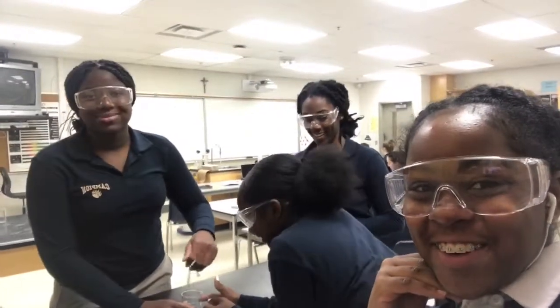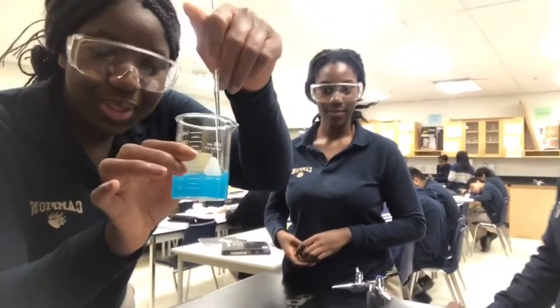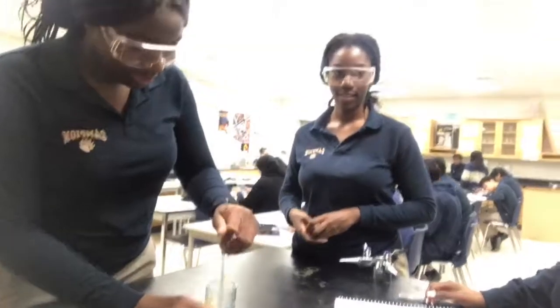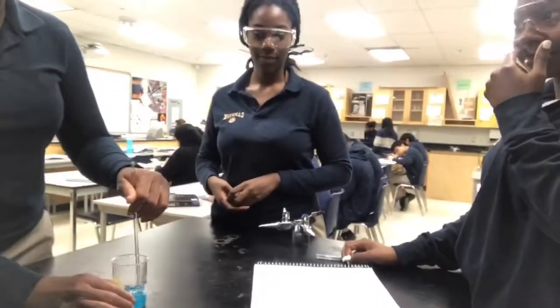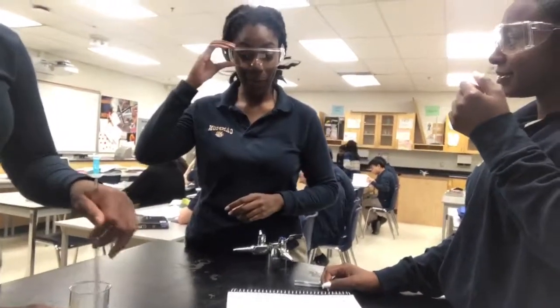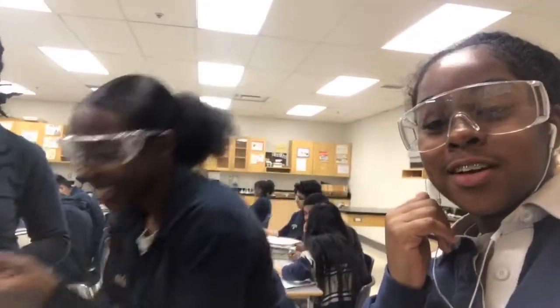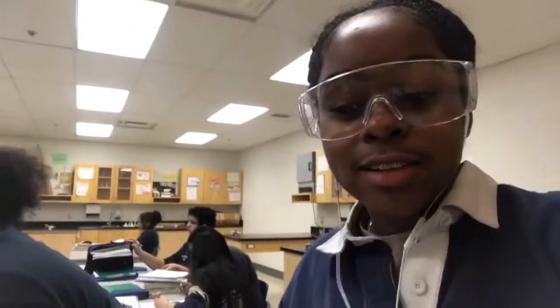Lab vlog 101. Tashi, what are you doing right here? What is this? This is water and copper chloride. Yeah? And what are we about to do with it? Tell me, Sierra, what are we about to do next? I think we're putting in some steel wool. That is exactly what we're doing. We're about to create that copper, people. And then we're going to calculate the percent yield.